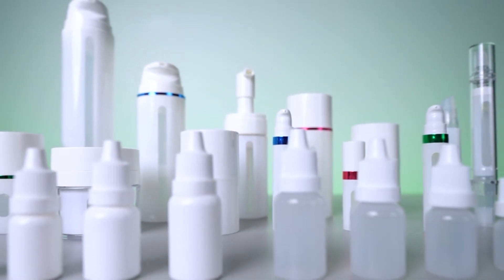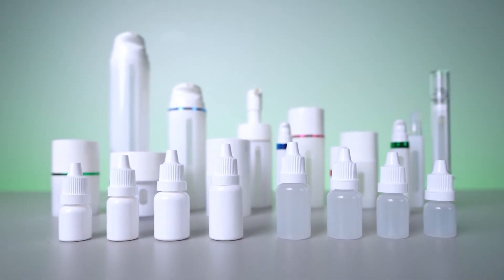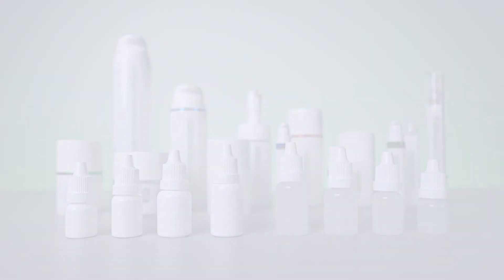Sterile and ready to fill, the MD ophthalmic dropper bottles are a sought-after addition to the Medisca MD product line with innovative capabilities that will streamline processes for sterile compounders.